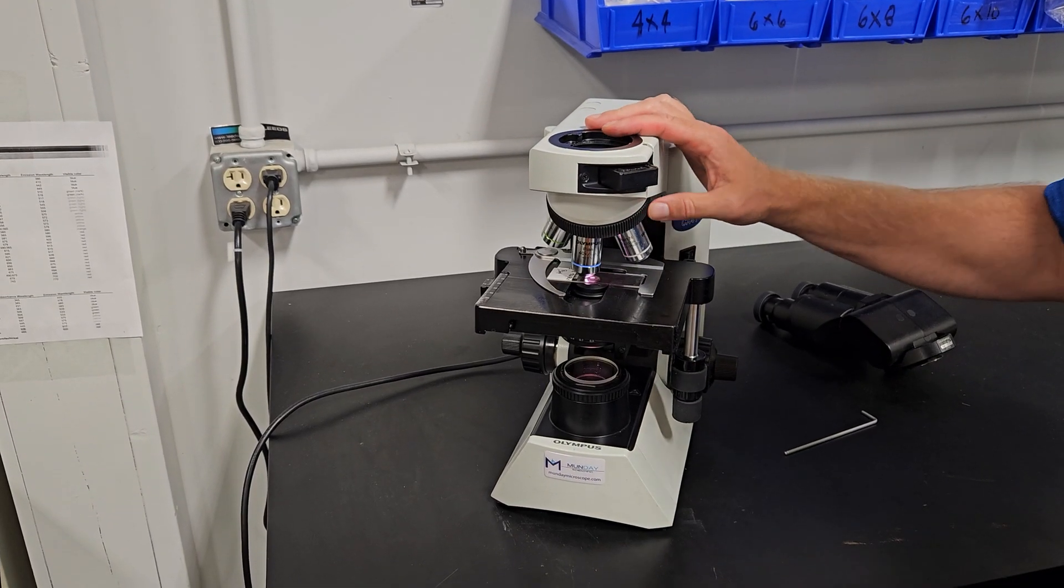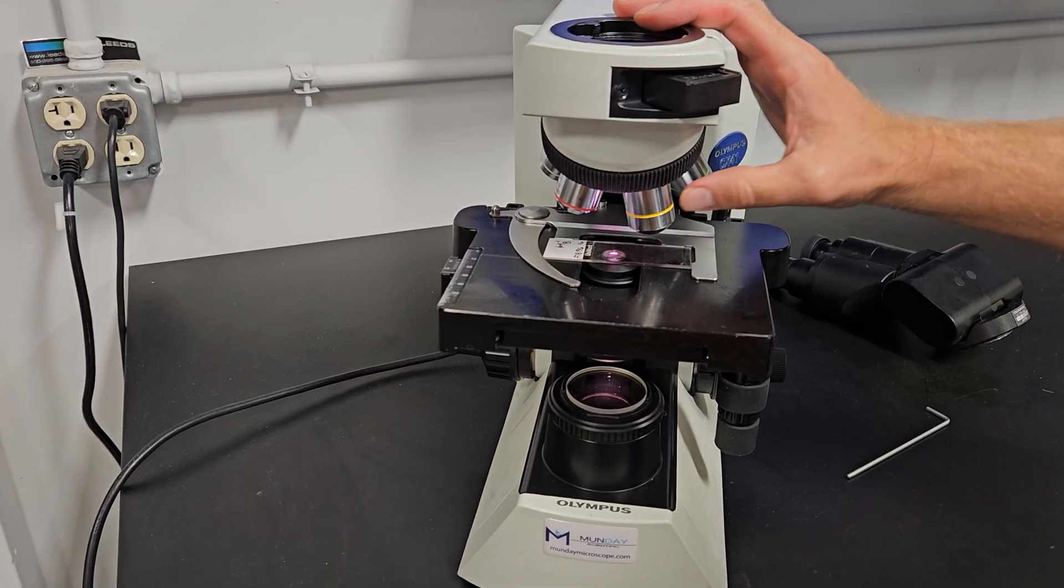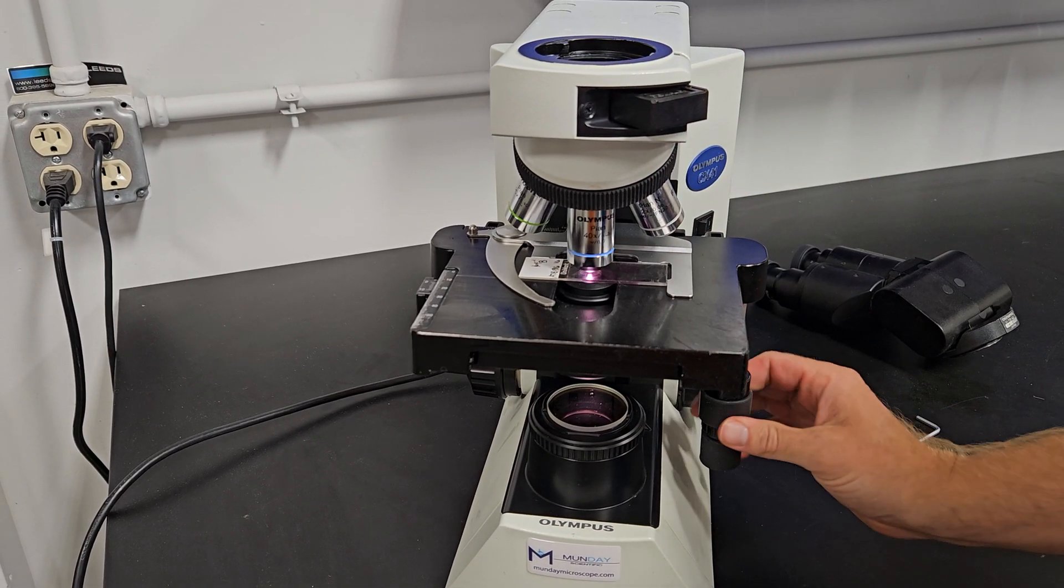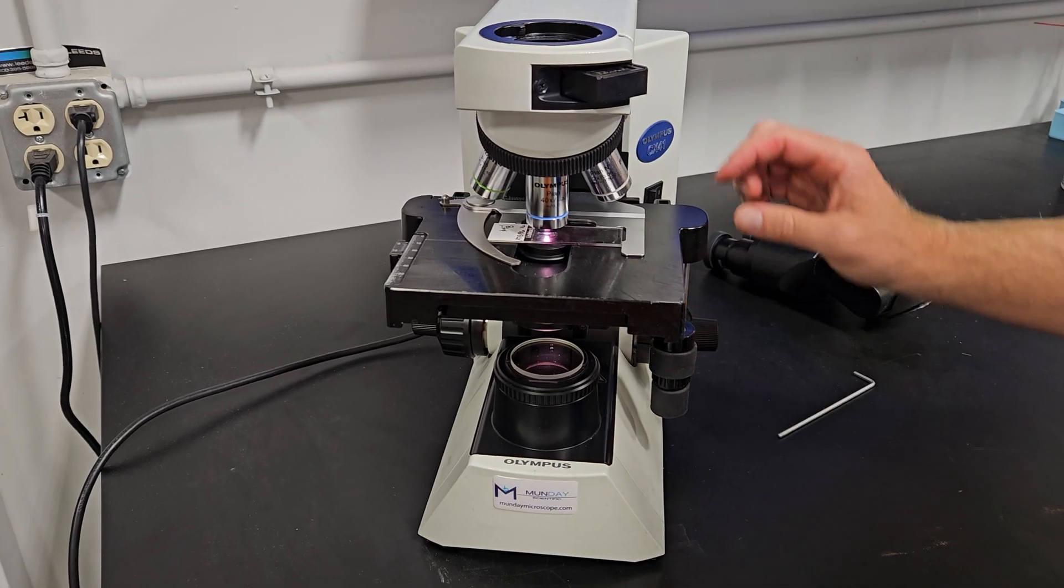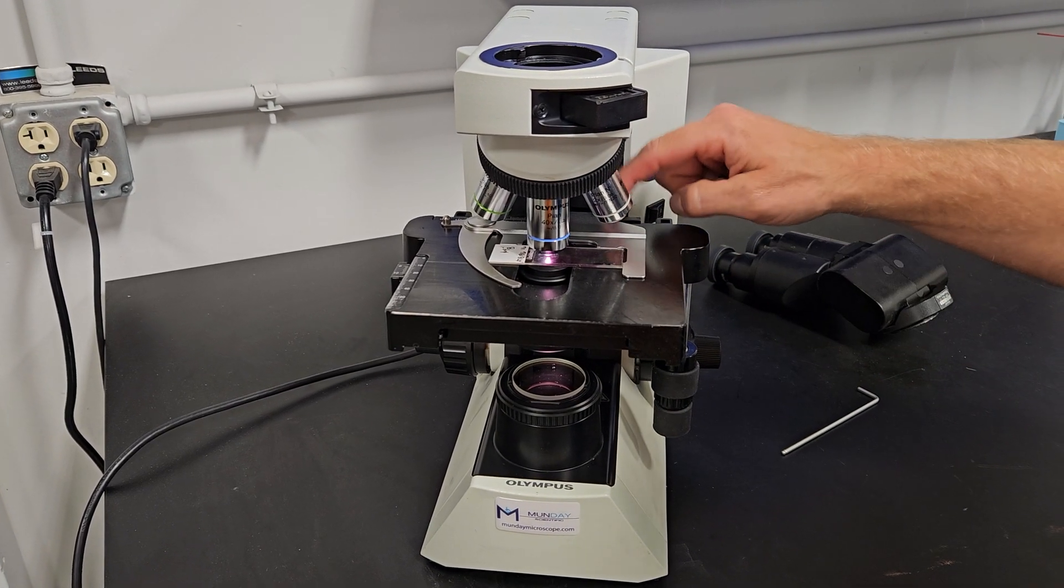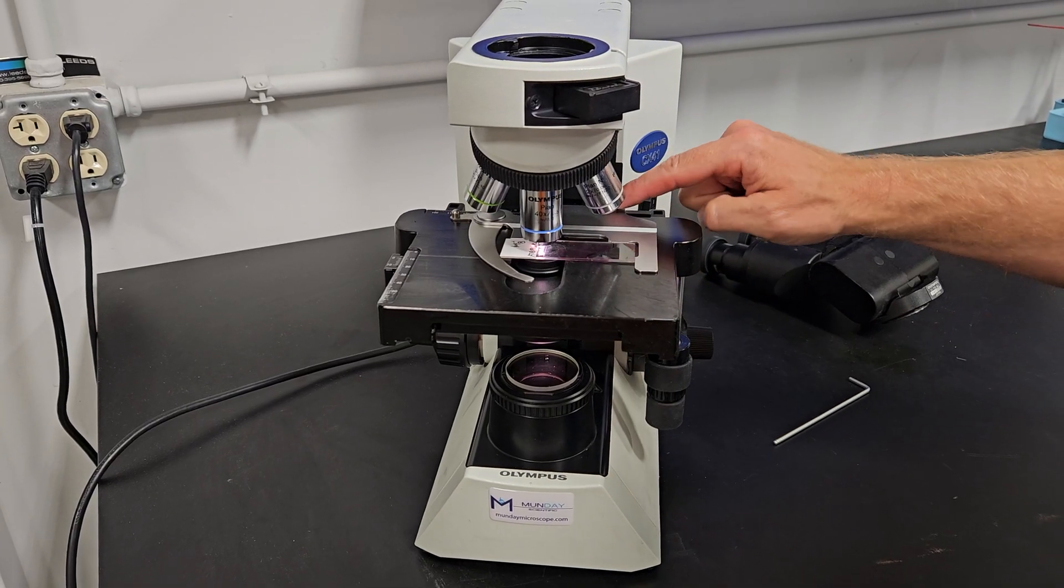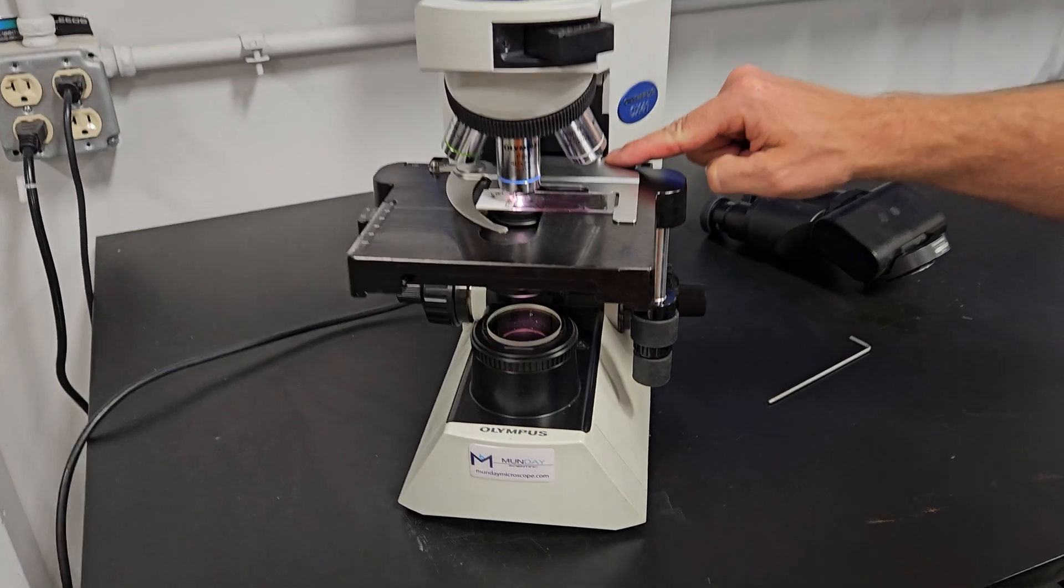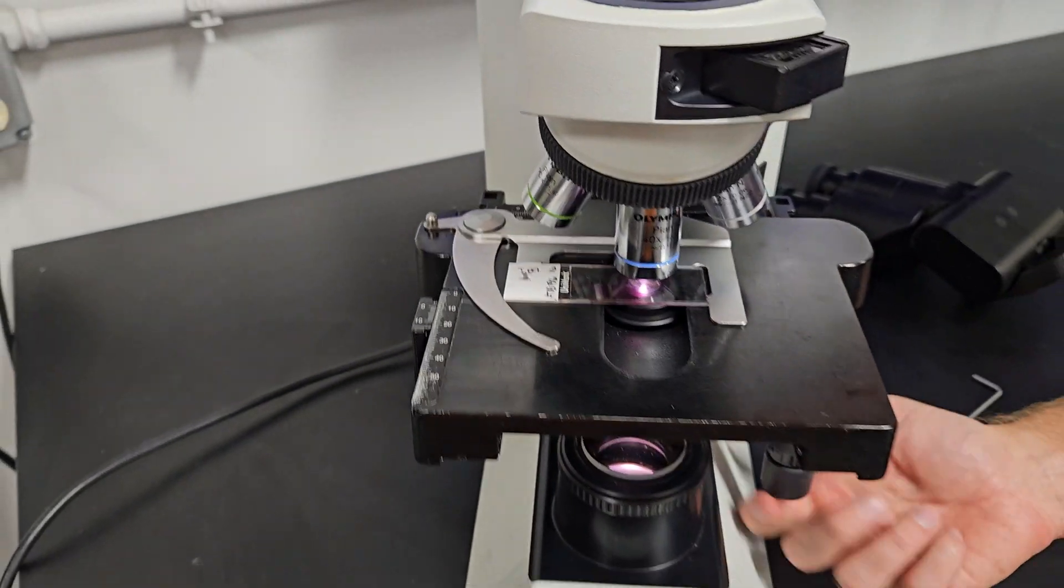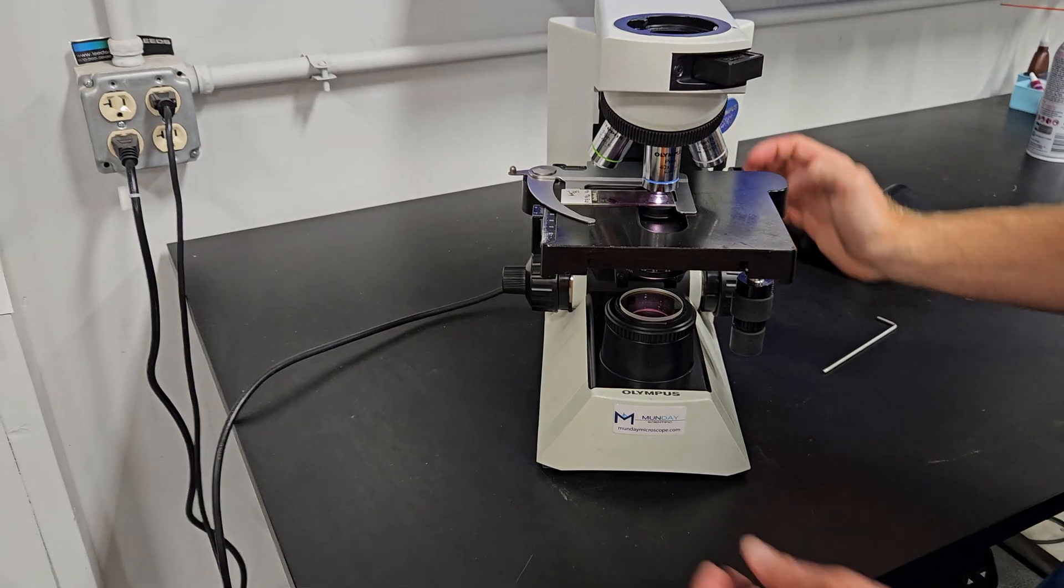You have a five place nose piece: 2x, 4x, 10x, 20x, and 40x. Right-handed stage. If you want to push the slide with your fingers, you can take the stage clip off and push it around. This is a 2.5 millimeter screw hole right here. You would just take this screw out and take this screw out and then the slide holder would come right off.